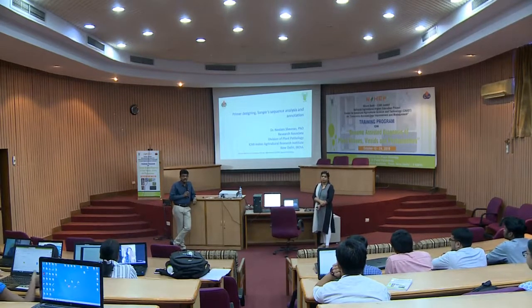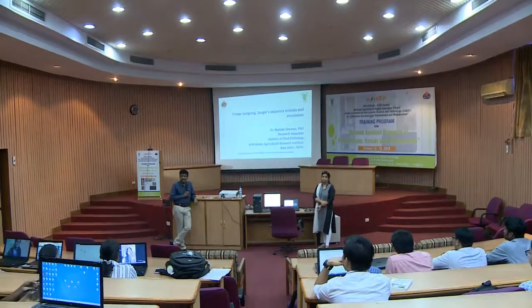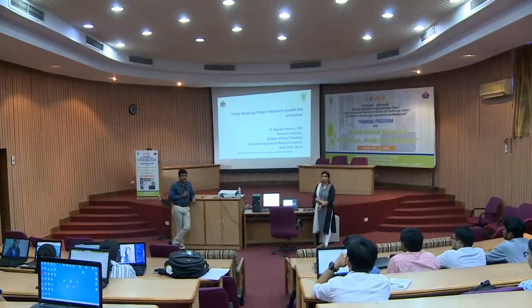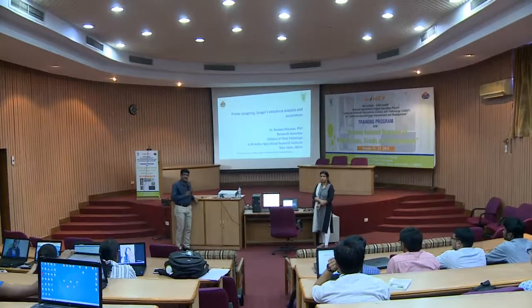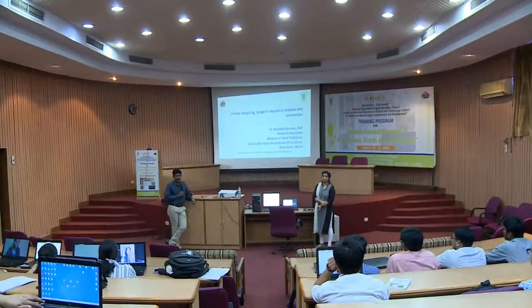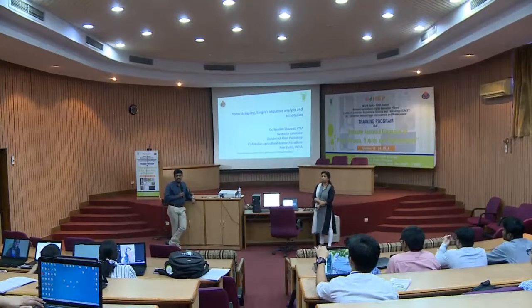I already indicated this morning, this afternoon is entirely for bioinformatic analysis, and we have taken the topic primer designing, Sanger sequence analysis and annotation. And this lecture will be delivered by Dr.